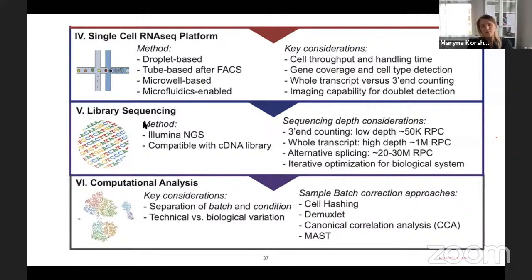After sequencing, you do raw data processing and consequent data processing, where you do genome alignment and calling of the molecules that you captured in your sequencing, and try to play around with this data. Making this data available for analysis is also a set of steps. As an outcome of this step, you might receive an overview of the cell types and cell clusters present in your data set. There are a lot of tools which you could use, but fortunately useful pipelines are already available. So actually that's all. This is the sixth step, which you might perform to carry out the single cell analysis.